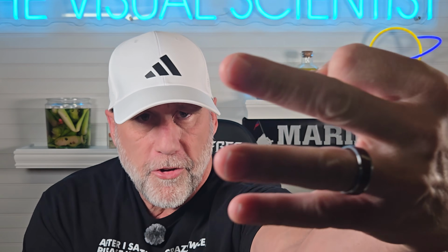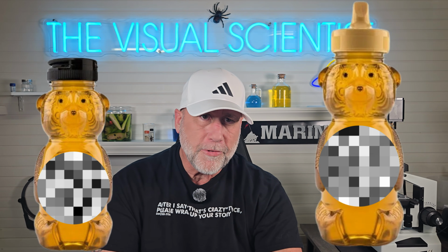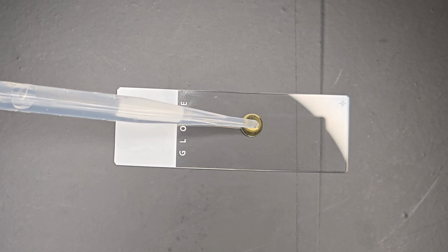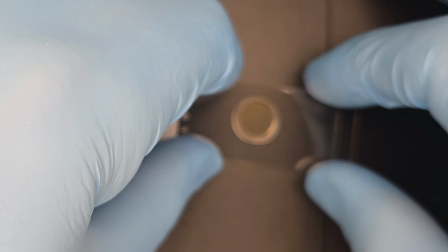Let's do this. 3 jars. Evidence A, B, and C. Labels are staying down until the whiteboard. I'm taking a small core sample from each jar. You can already see differences, which I find crazy. Adding a single drop of distilled water to help with viscosity and prepping 3 separate slides.